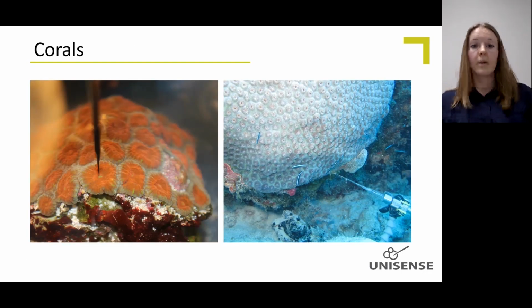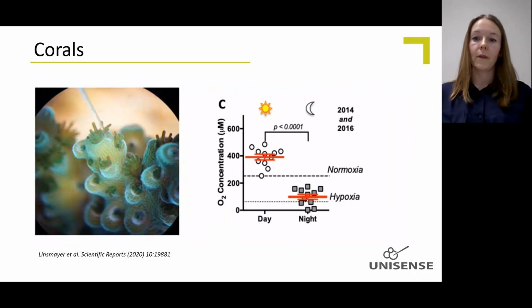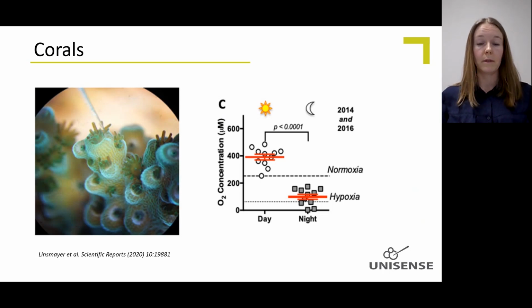Microsensors are also widely used for monitoring coral reef ecosystems, both in situ and in the lab. And here is a study where microsensors were used for monitoring coral reef ecosystems. And they were used to characterize the oxygen concentration in the coral diffusive boundary layer surrounding the coral throughout the diel cycle.